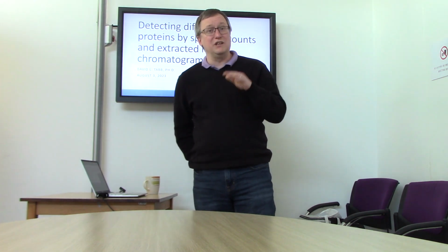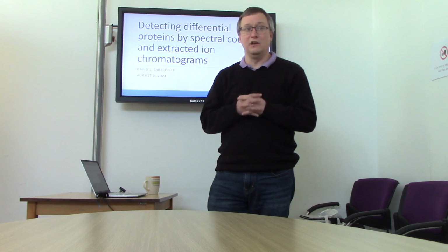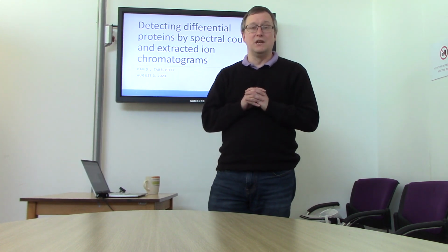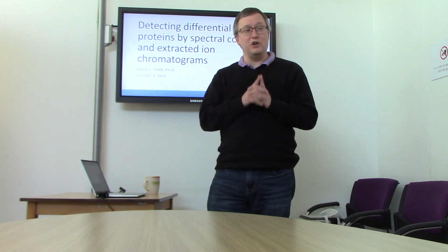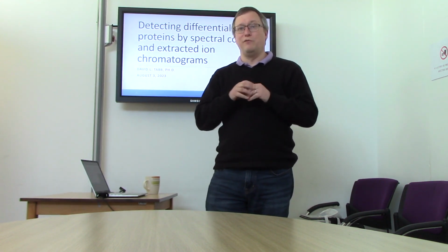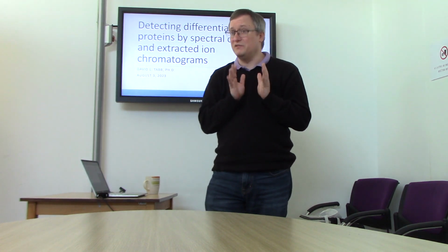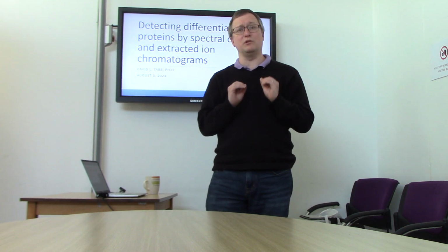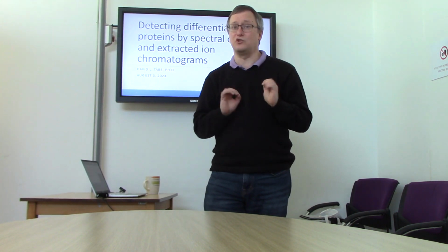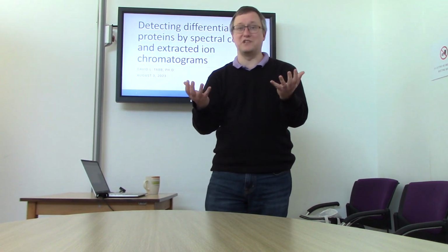And over time, there have been a lot of different methods put forward about how we should go about quantifying through mass spectrometry. In general, the number of people who send a sample to a proteomics core facility for a simple inventory, what proteins are here, is relatively small. In fact, most people are trying to make some sort of question about differential proteomics. In other words, how do these samples differ from those samples?